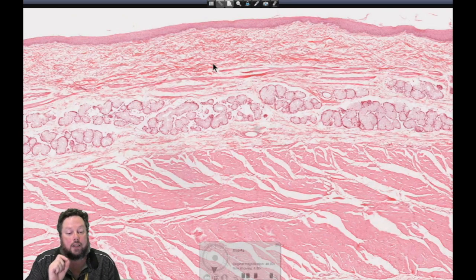Submucosa, I did mention that the upper third and the distal third may have mucus secreting glands, so that's how you can sort of tell those two, but you can't use those features because they're found in both regions, so you actually need to keep that in mind.